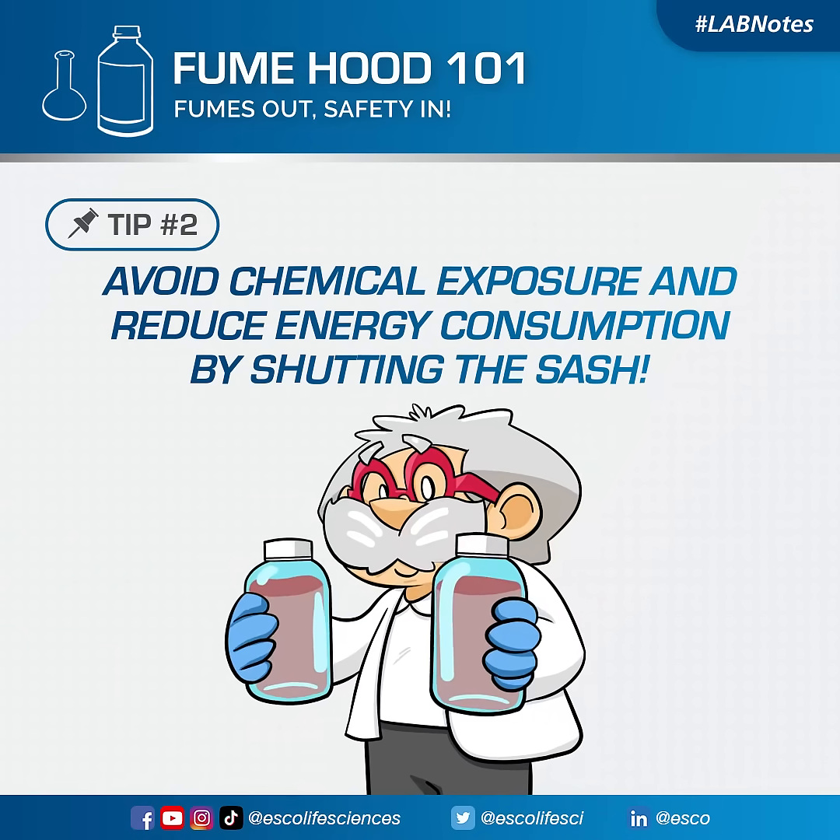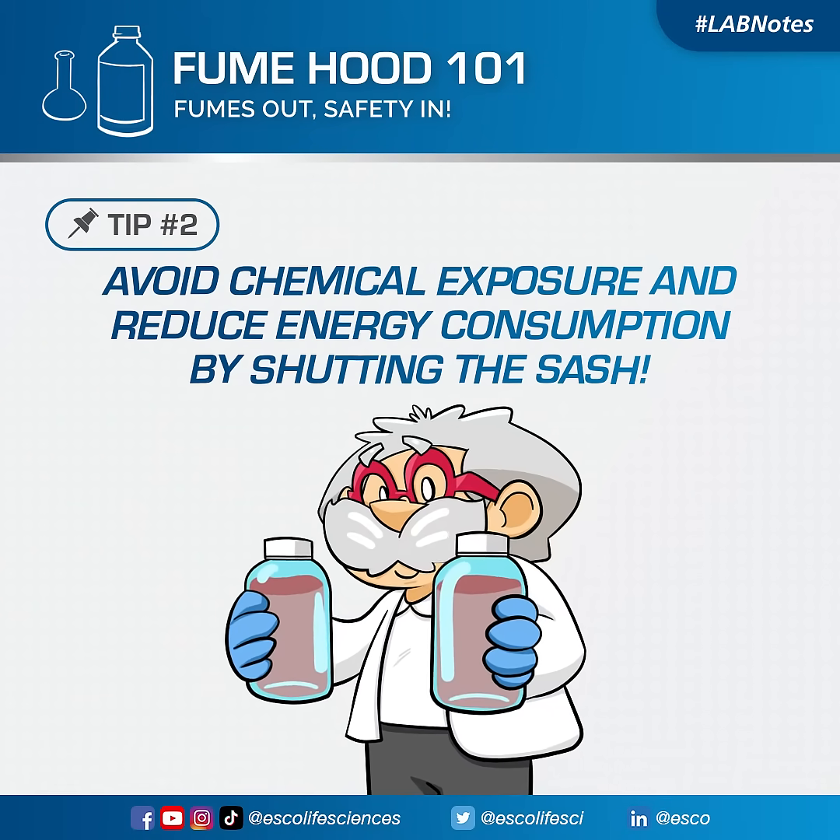Avoid chemical exposure and reduce energy consumption by shutting the sash.